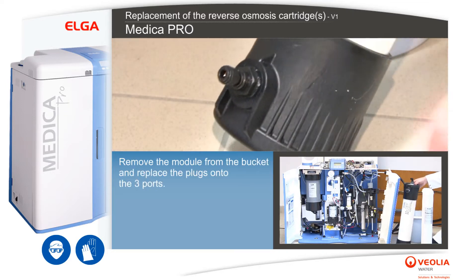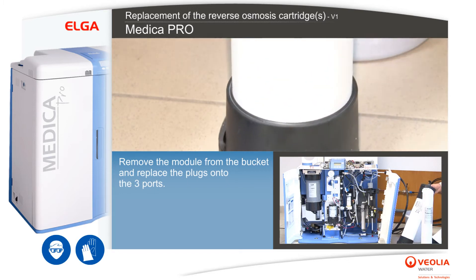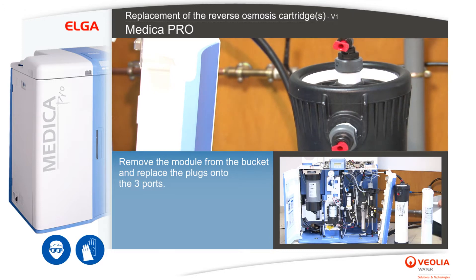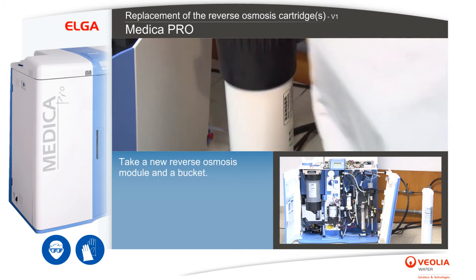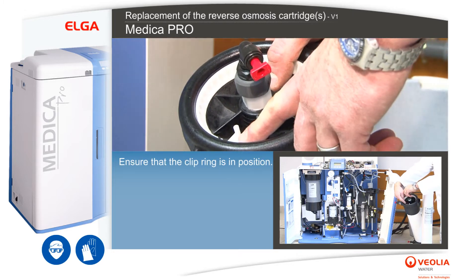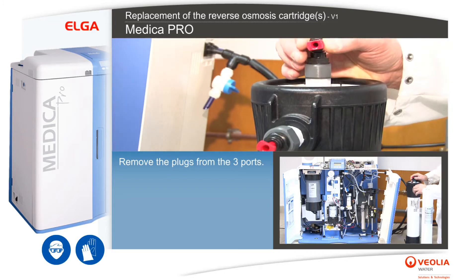Drain the module completely. Remove the module from the bucket and replace the plugs onto the three ports. Empty the contents of the bucket into the drain. Take a new reverse osmosis module and a bucket. Ensure that the clip ring is in position and remove the plugs from the three ports.